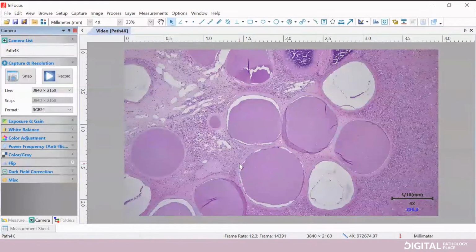Yes, I love it. And now I'm on my laptop, but I was trying this on my 2K screen, and it's a 4K camera, so I am not even exploring the full resolution I could here. But I am very happy with the new C-mount. We don't have the vignetting anymore, and it's really nice, perfectly in focus, even on the edges of the image, which is super important because then it saves you cropping the image.